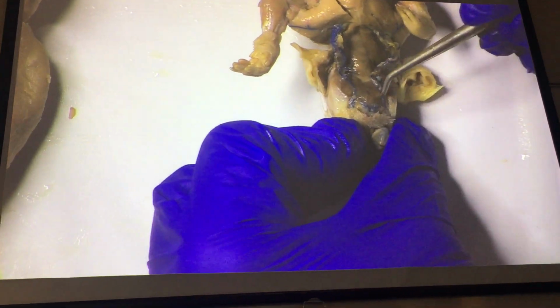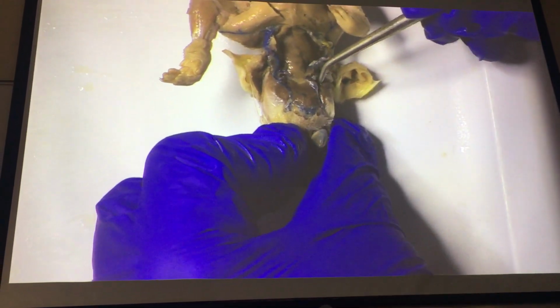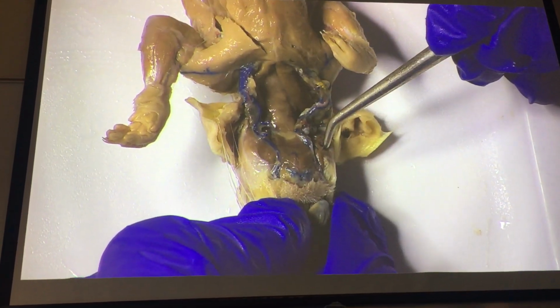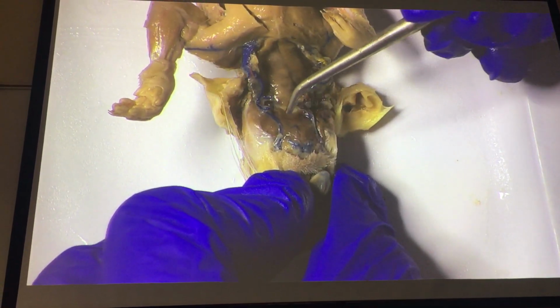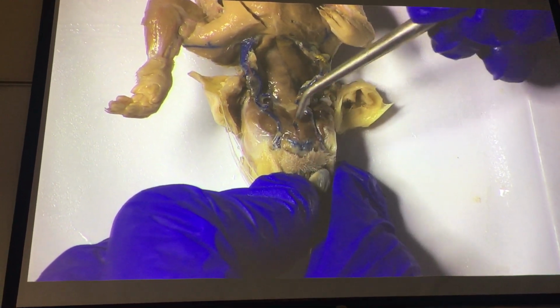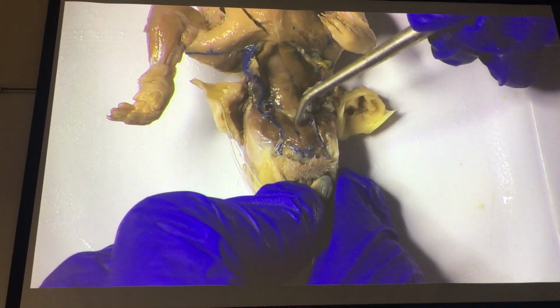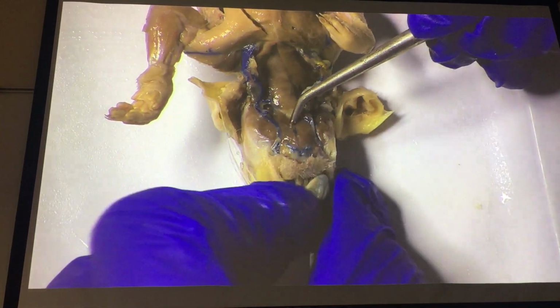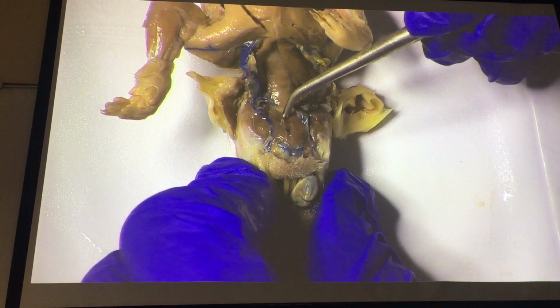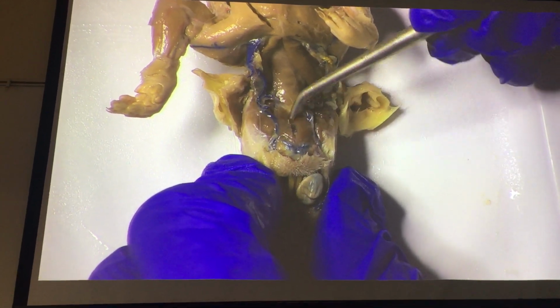So here we can see our masseters. That's an obvious one for action, right? Mastication would work. Close the mouth. Here we have our digastric, which is the antagonist of the masseter. The digastric being involved in opening the mouth, right? Depressing the mandible. Easy way to remember it, when someone opens their mouth, you can be depressed because they're going to start talking.